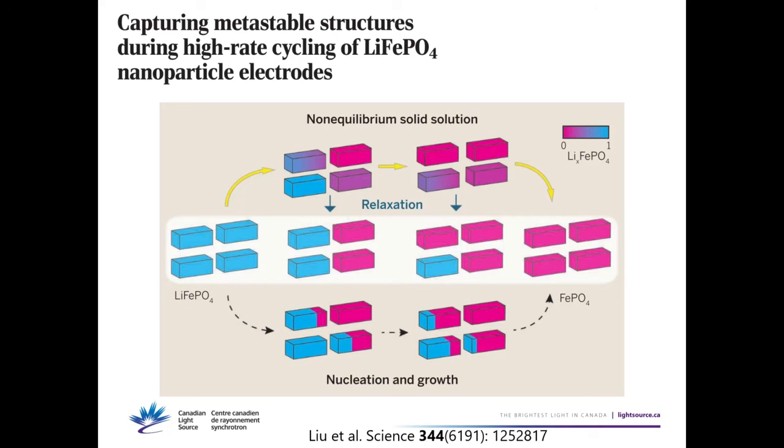And then comes the importance of the result. That you don't want big phase changes with volume changes or clear boundaries moving in batteries. It's generally associated with degradation of the battery.